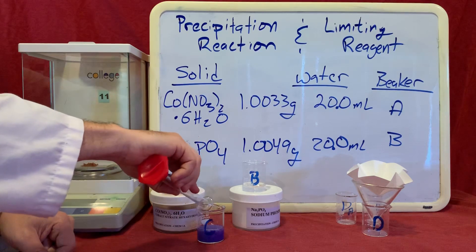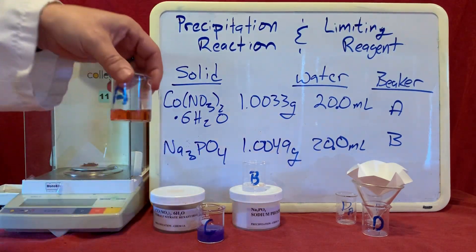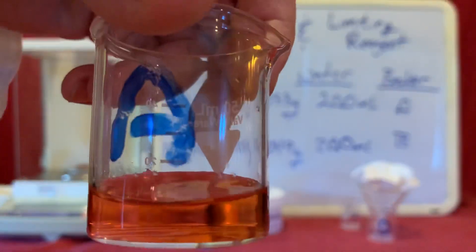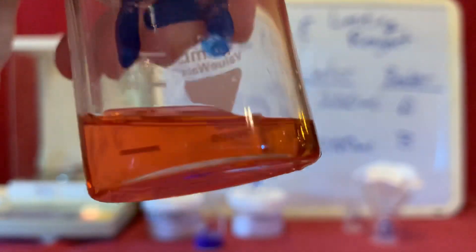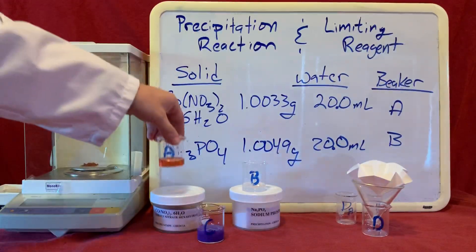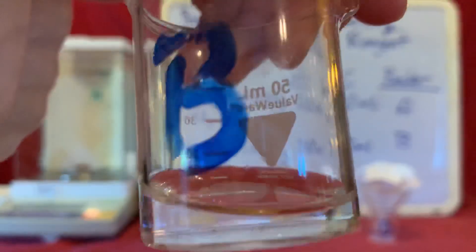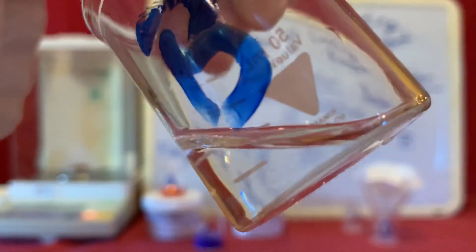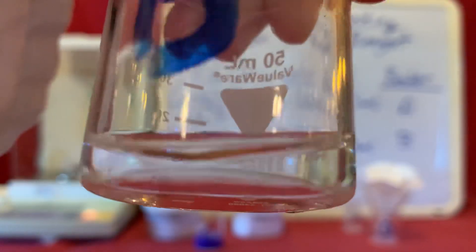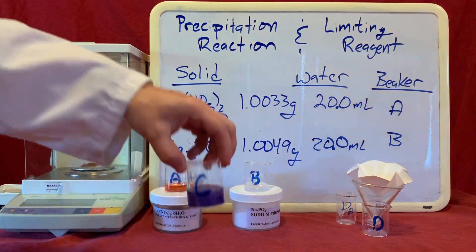Let's compare these three solutions. Here we can see solution A. Here's solution B. And here's the contents of beaker C.